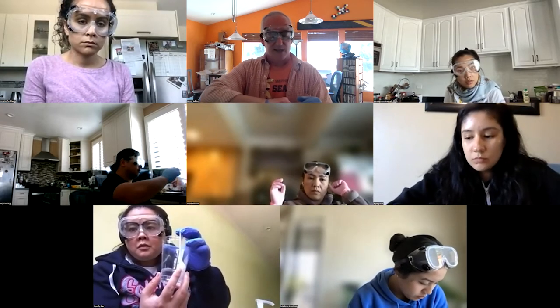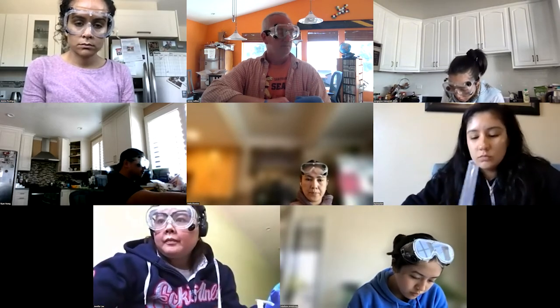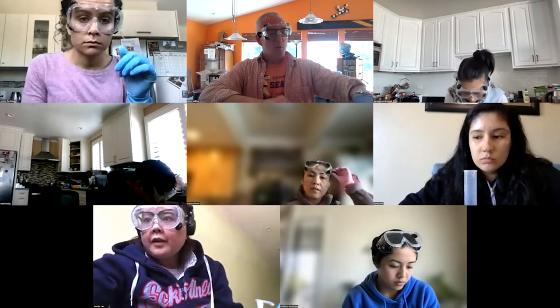You can throw the rest away. You only need 25 mils of it, and once you're done with that, you can toss it all out. But you're going to want to save half of your hard water mix for your homemade stuff.